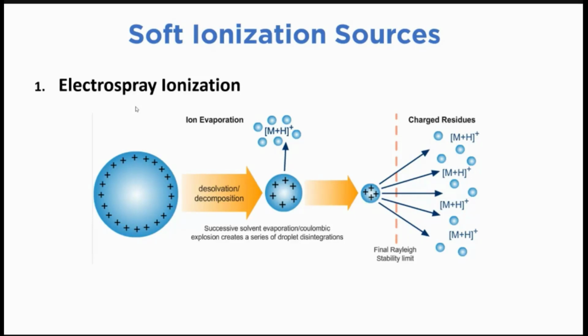And then you try to evaporate the liquid in that droplet as quickly as possible with a very hot neutral gas like nitrogen. And when you do that, the liquid, the water, evaporates out of the droplet really quickly.